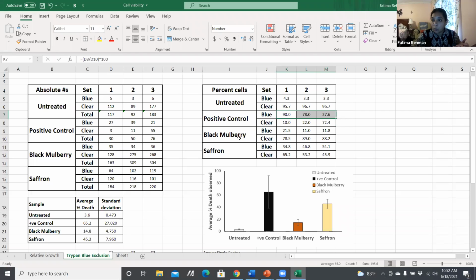So we just have that one cell line that we are treating. And these treatments, in our case, we're not doing any combined treatments. Two of these are controls, and these are just considered antioxidant or supplements with antioxidant. So we're going to consider them with the simplest setting, which is a single factor ANOVA, whether treatment with a particular drug is killing it or not, right?